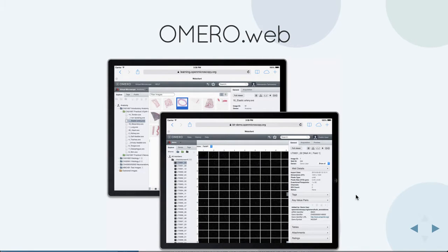As I said before, in some cases it's possible to use OMERO web to publish the whole repository. Here are examples of that. This is IDR and this is Virtual Microscope.